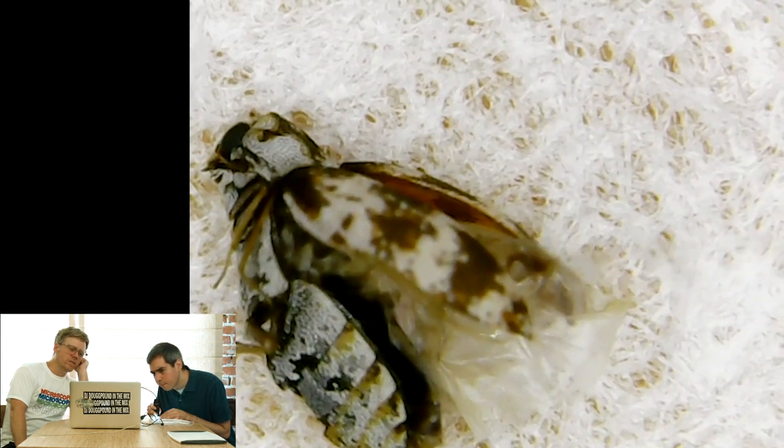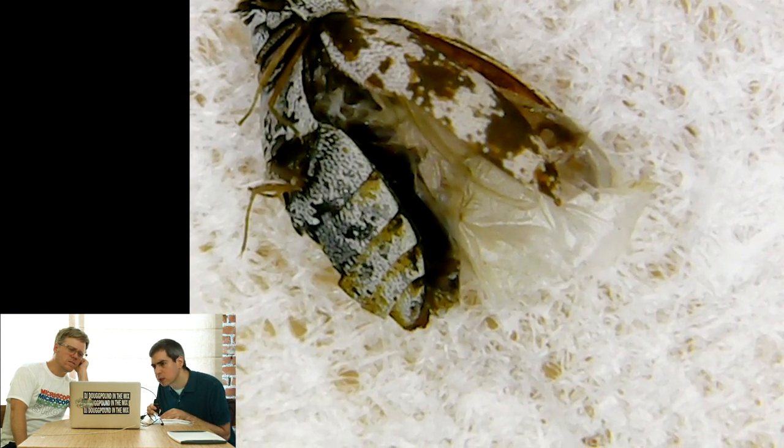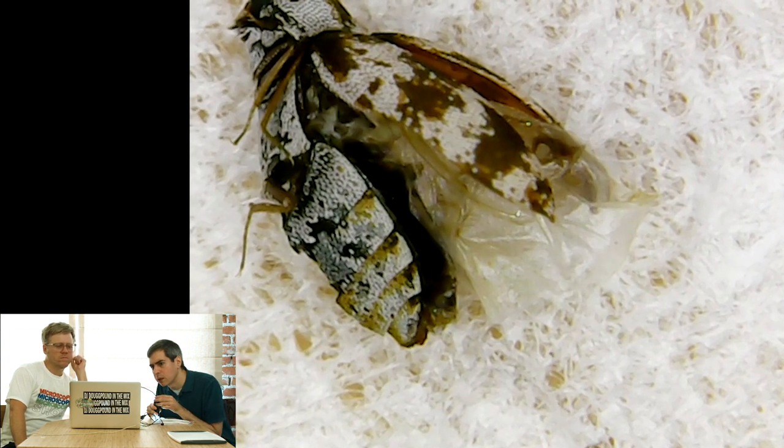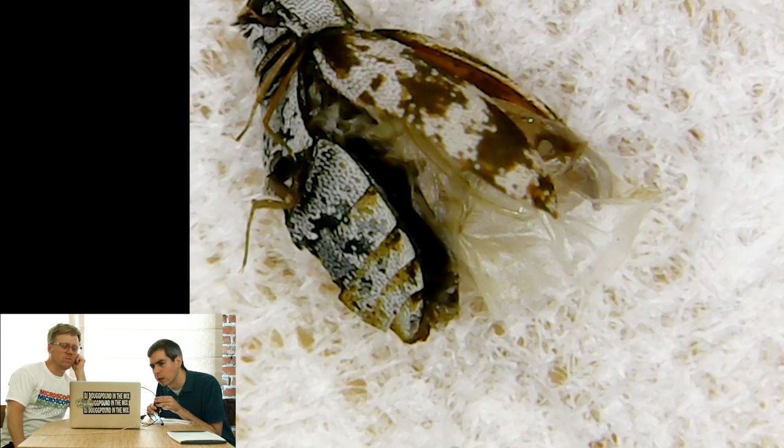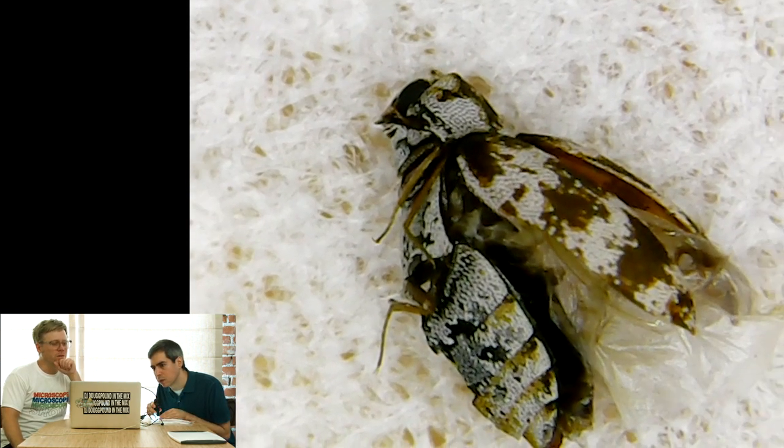I think he might have destroyed it, so I don't know how to identify it. Right, I guess, wow, so is that just the guts of it in there? Look at that. Oh, no, that's the wing. Those are the wings. The shell. This thing is tiny. So it's like a beetle kind of a bug.